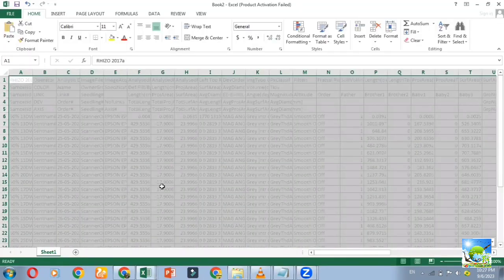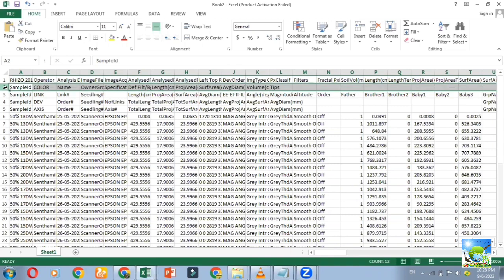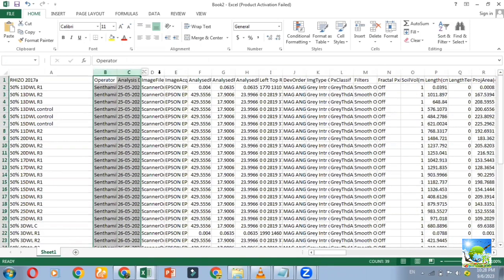For extracting the data, directly open the file with MS Excel or open with Notepad, copy the whole data and paste it in MS Excel. Delete the second, third, fourth, and fifth rows, then delete the unwanted columns to get the required data.